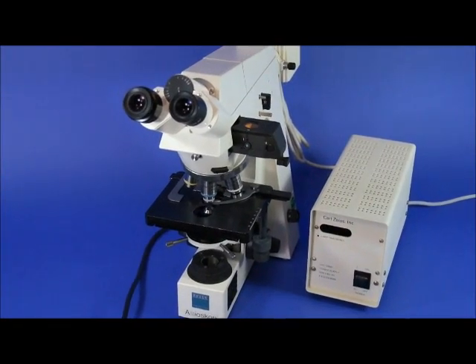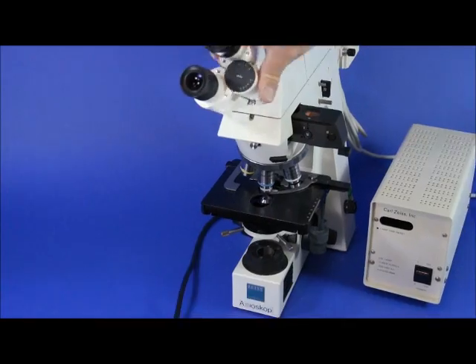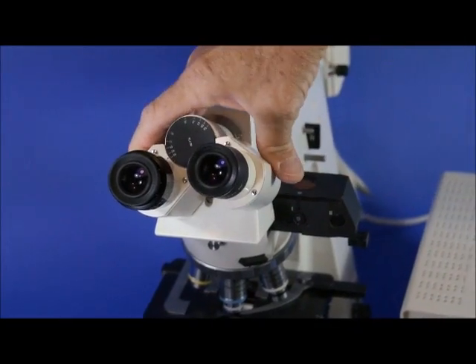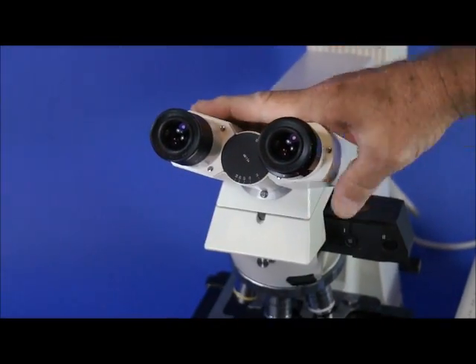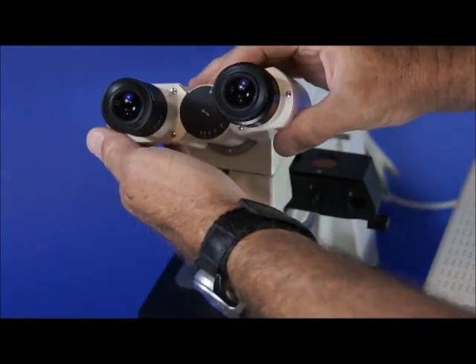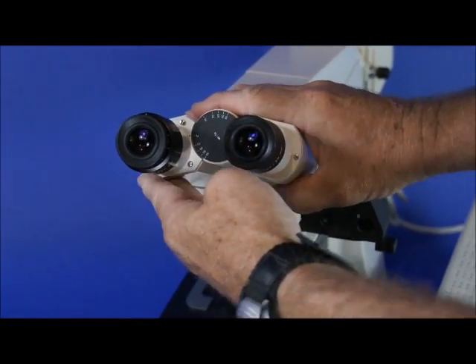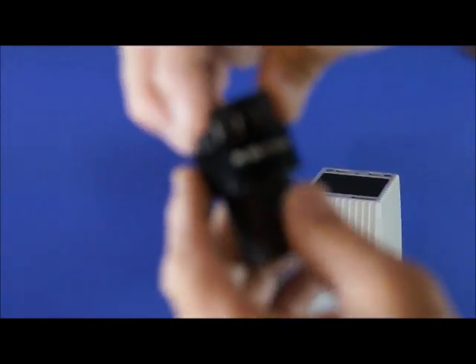Okay, this is a Zeiss Axioskop, and it's equipped with a lot of goodies. One of them is this 360 rotatable binocular head. As you can see, this is very useful for accommodating different heights, and so you don't really need an inclinable head. You've got this really nice swivel 360 head.